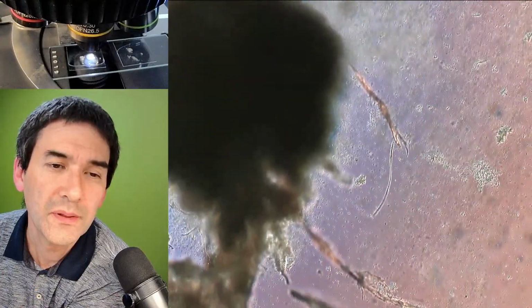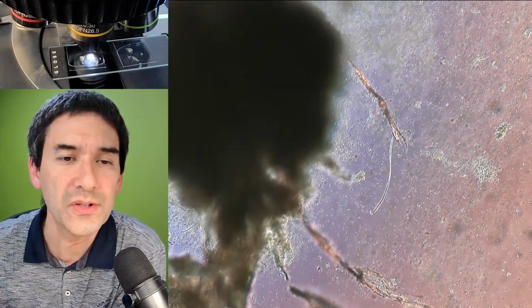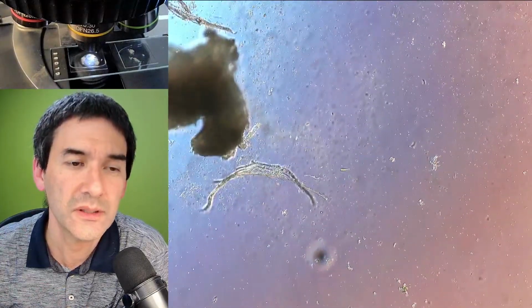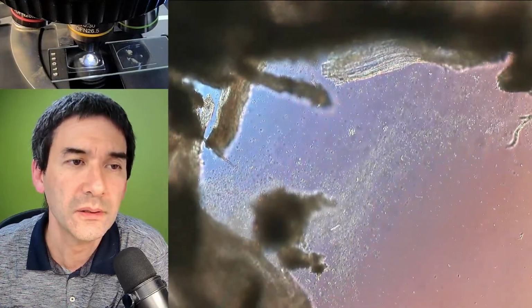Sometimes there are those thin, regular-looking fibers in there, where I know that this is not plant material. Some of those irregular ones could be plant material.